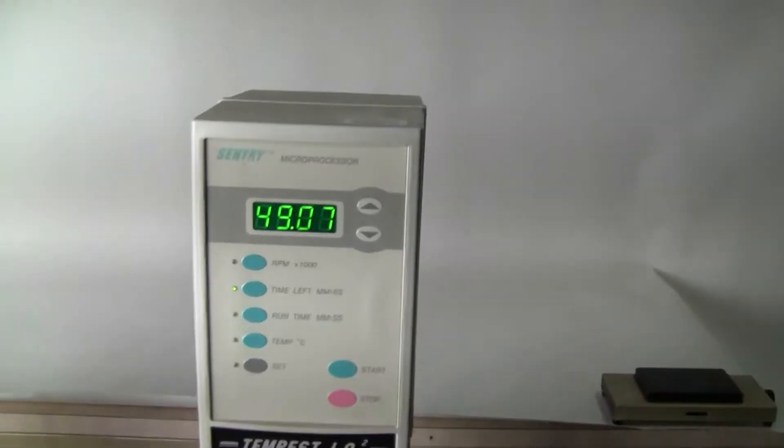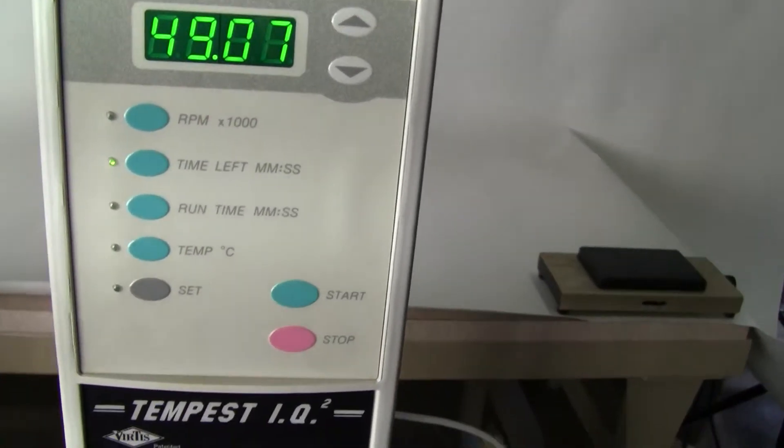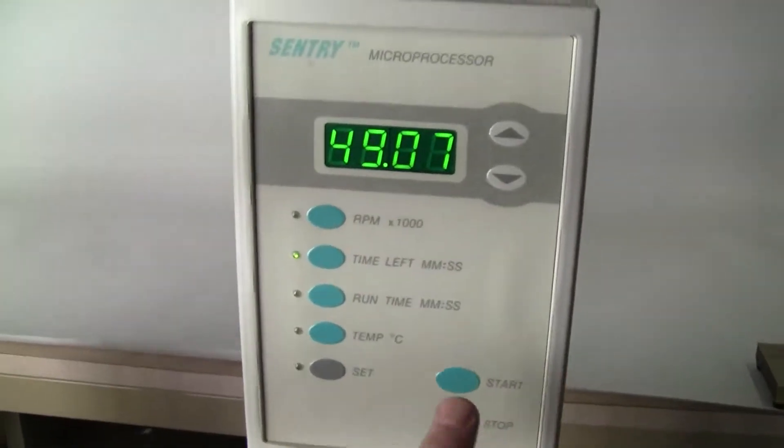It's fully programmable, up to 30,000 RPMs. You can also program timing on it and temperature. I have it set for 10,000 RPMs right now. Let's take a look at it.